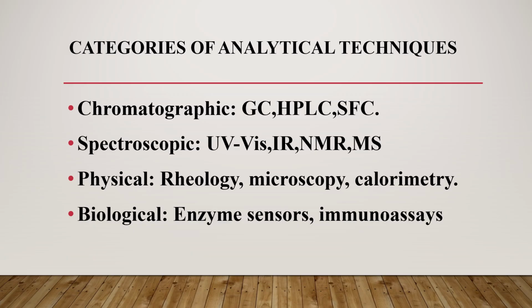Categories of analytical techniques. Food analysis techniques fall into four major categories. Chromatographic methods, which include GC, HPLC, and SFC. Spectroscopic methods, which include UV-VIS, IR, NMR, and MS. Physical techniques and biological techniques.